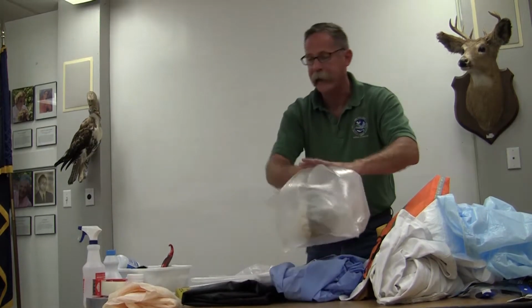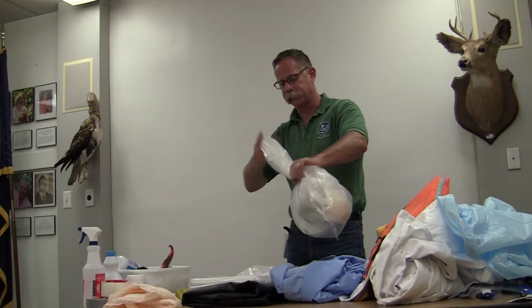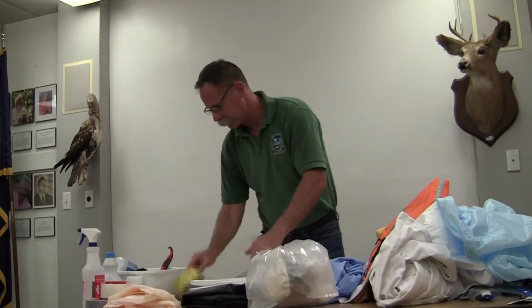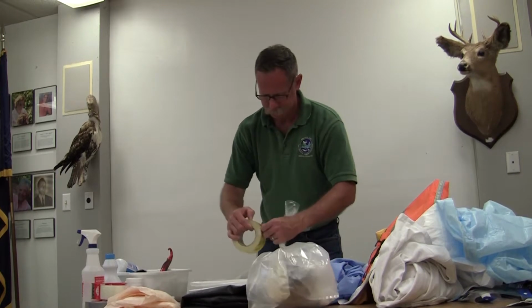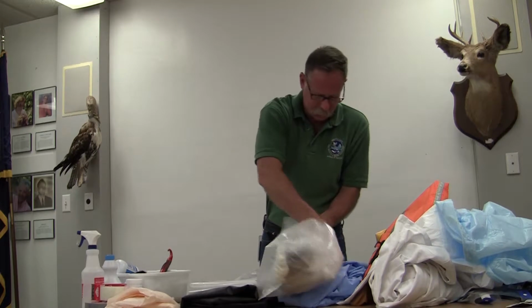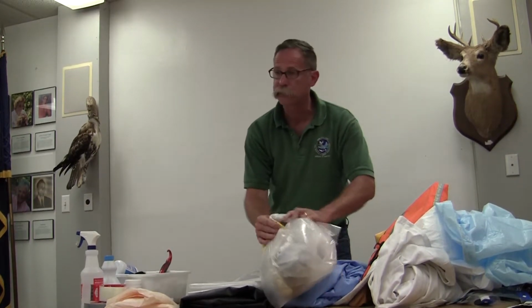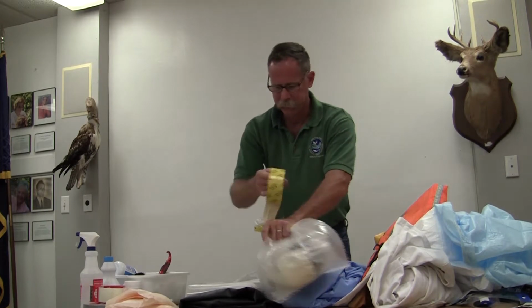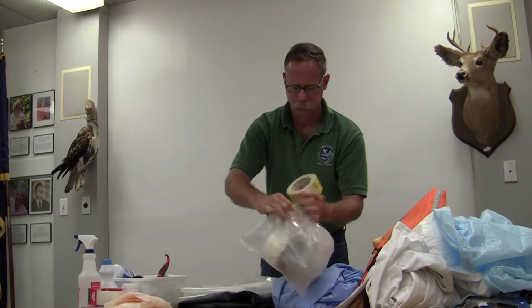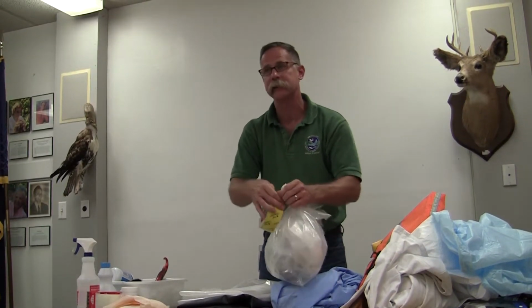And that 6 mil bag is really hard to tie a knot in. So what we generally tell people to do is twist it. You can get a good twist on it. Use some duct tape. Wrap it around 3 times, and then fold this twist over, and then wrap it around that. And that'll give you a pretty good leak-proof seal.